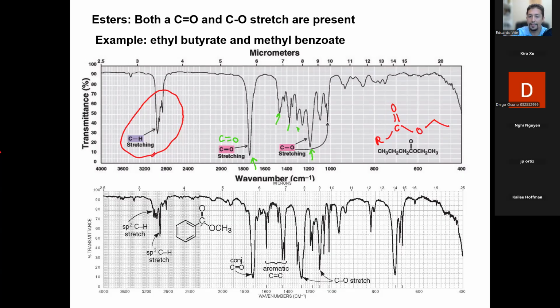What about aromatic esters? Well, again, when you have an aromatic system, the CH stretches are not as intense. So notice once again, they are still here, but now they're actually useful. They're a little more specific. Look at that peak. That is an aromatic sp2 CH stretch right over here, of a conjugated system. That's this carbon-hydrogen vibration, because now it's a little stronger because it's not a single bond anymore. It's a double bond or a bond and a half. So you do see some of it. But in general, you can get more information from looking at the rest of the spectra.